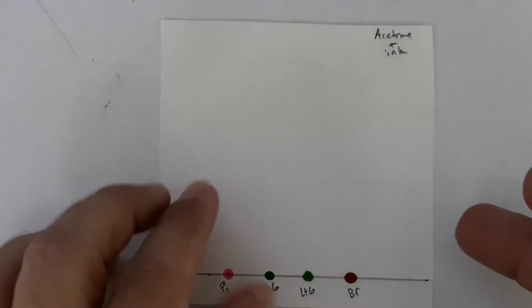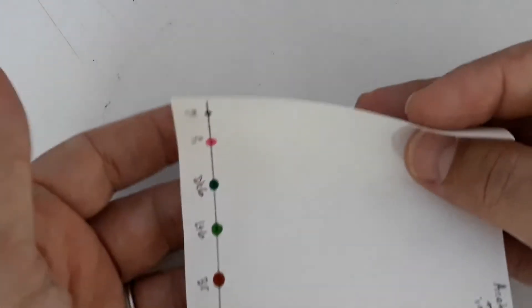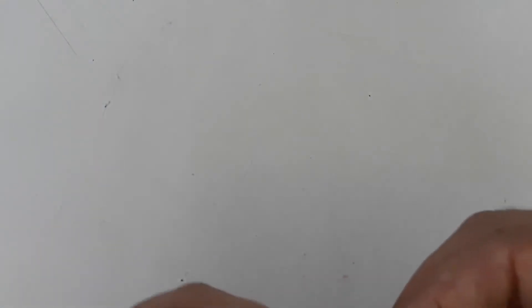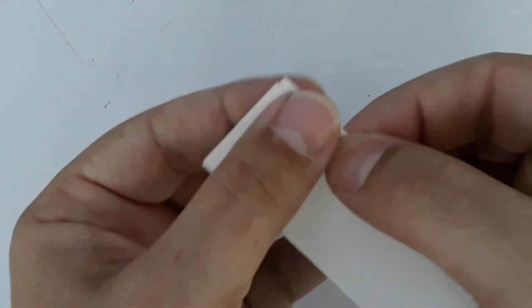All right, so the paper is almost set up here. We need to fold it. We're going to fold it what's called accordion style. I'm going to fold it once or twice, just alternating front or back so that it will stand up in the development chamber.